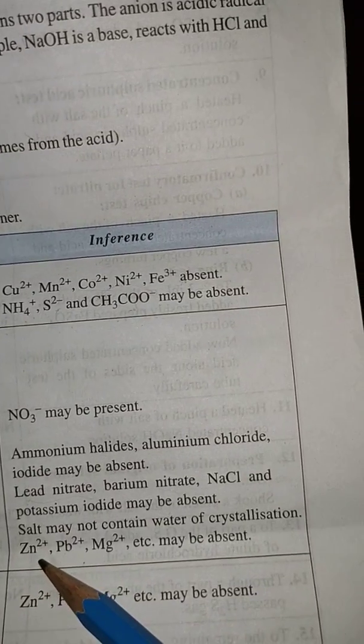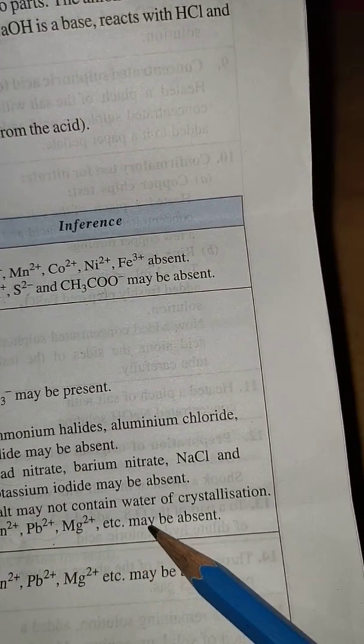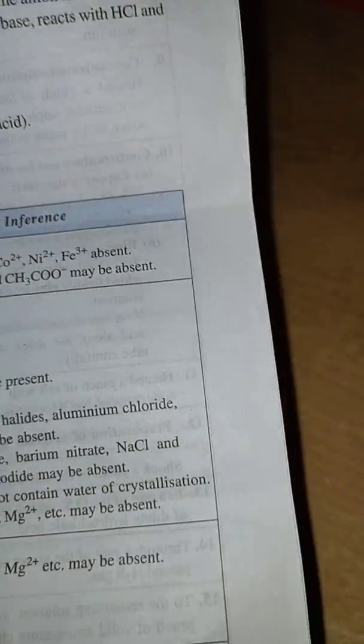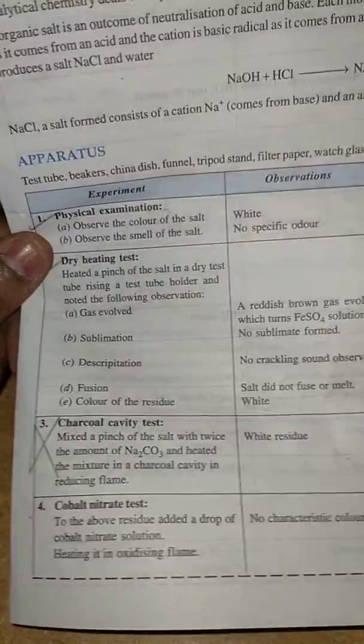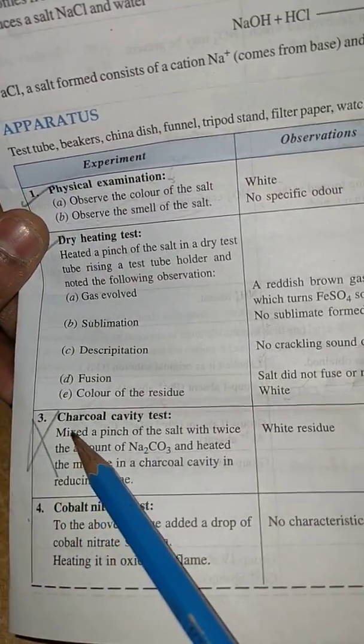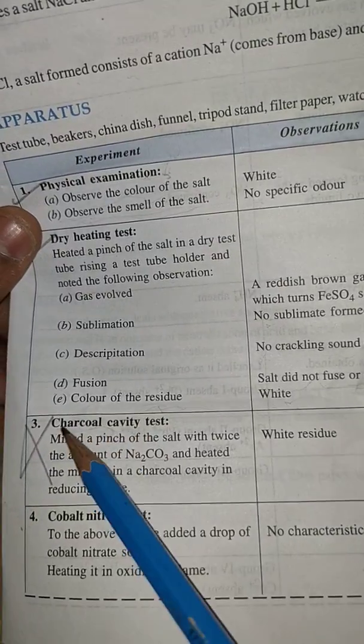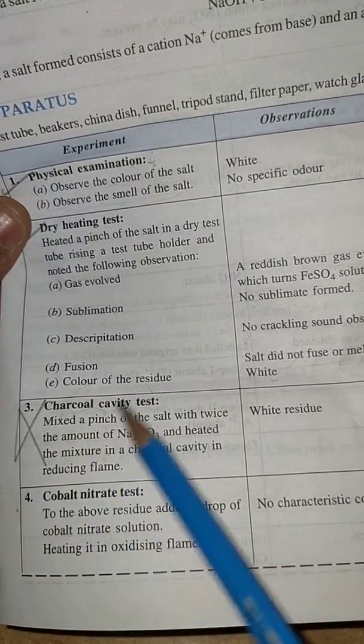So it may be Zn²⁺, Pb²⁺, Mg²⁺ etc may be absent. The next activity you will not do in the lab manual is the charcoal cavity test.